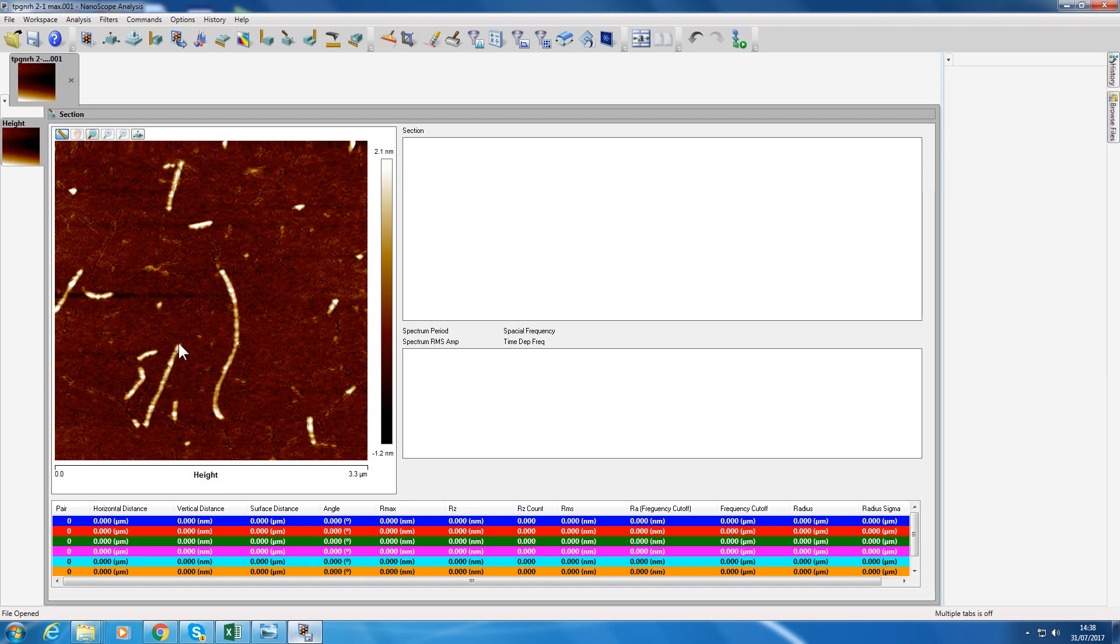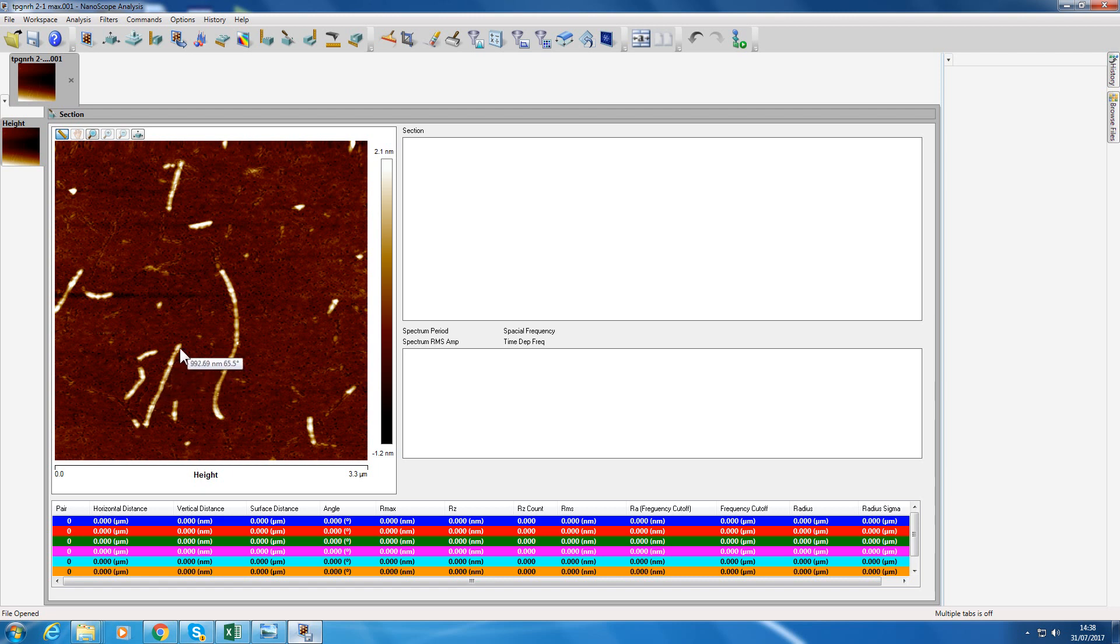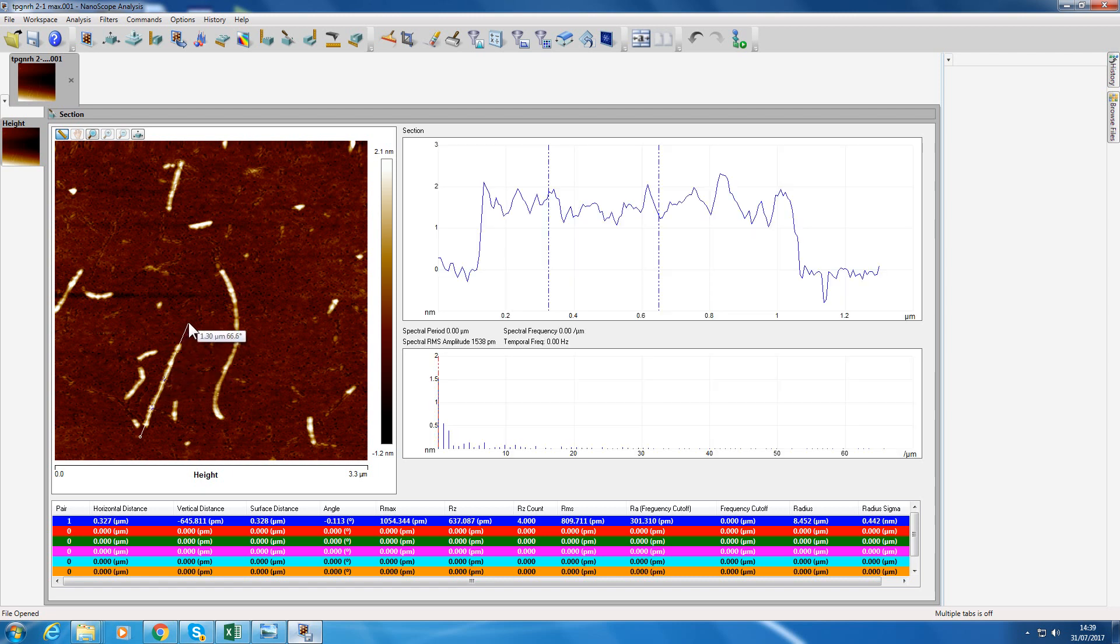Let's have a look at this nanofiber here. Let's measure its length. If I position the arrow down at the bottom left here and then draw a line, click left mouse button, drag it up through the fiber to the tail there, let go of the left mouse button. That is a section going through that fiber.